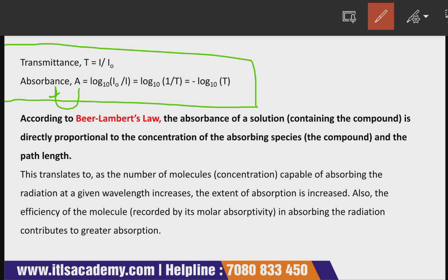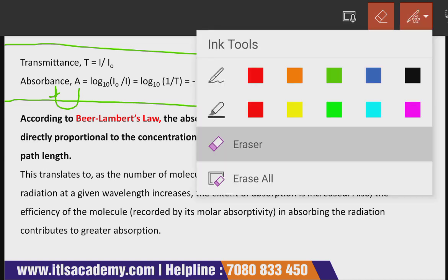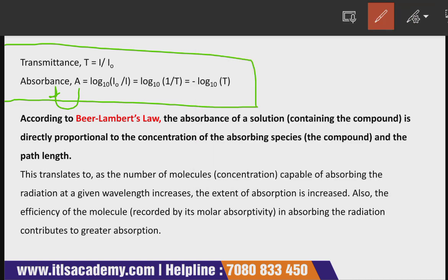of a solution containing the absorbing species is directly proportional to the concentration of the absorbing species and the path length.